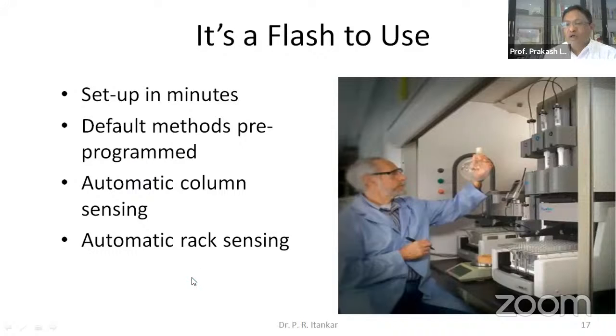And after this, if you have not added this rack inside, then the machine will not start, because the machine will sense that there are no collection test tubes at the bottom, and therefore there is no point in running this system.